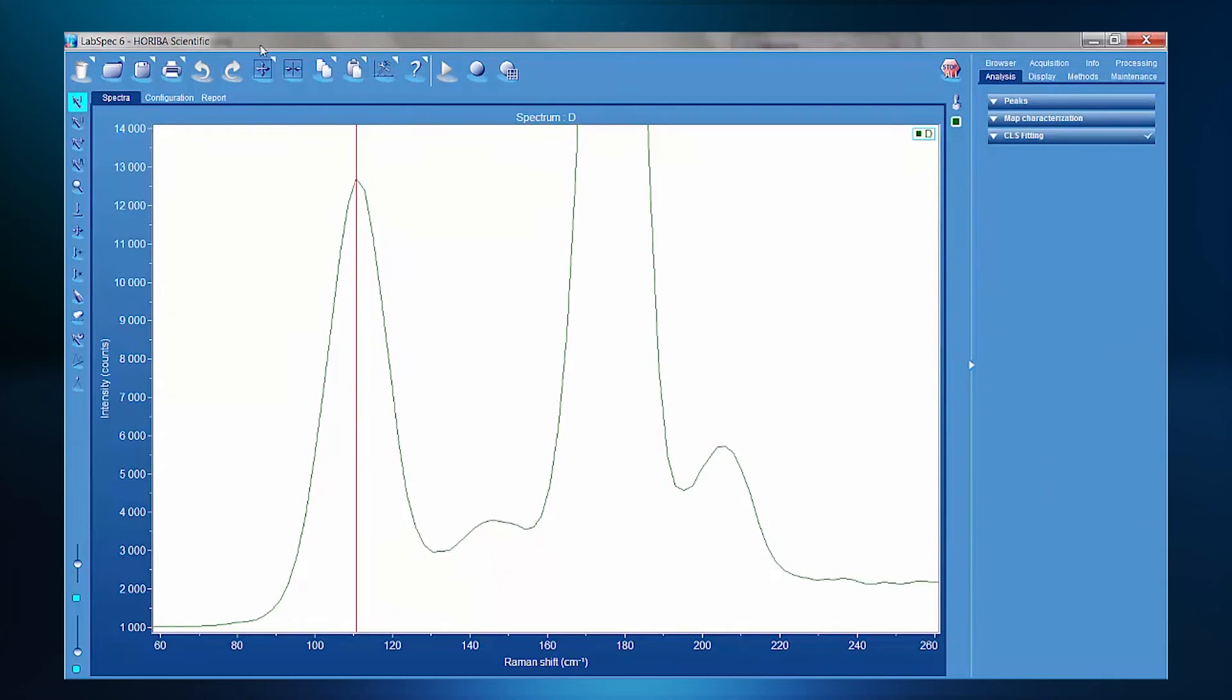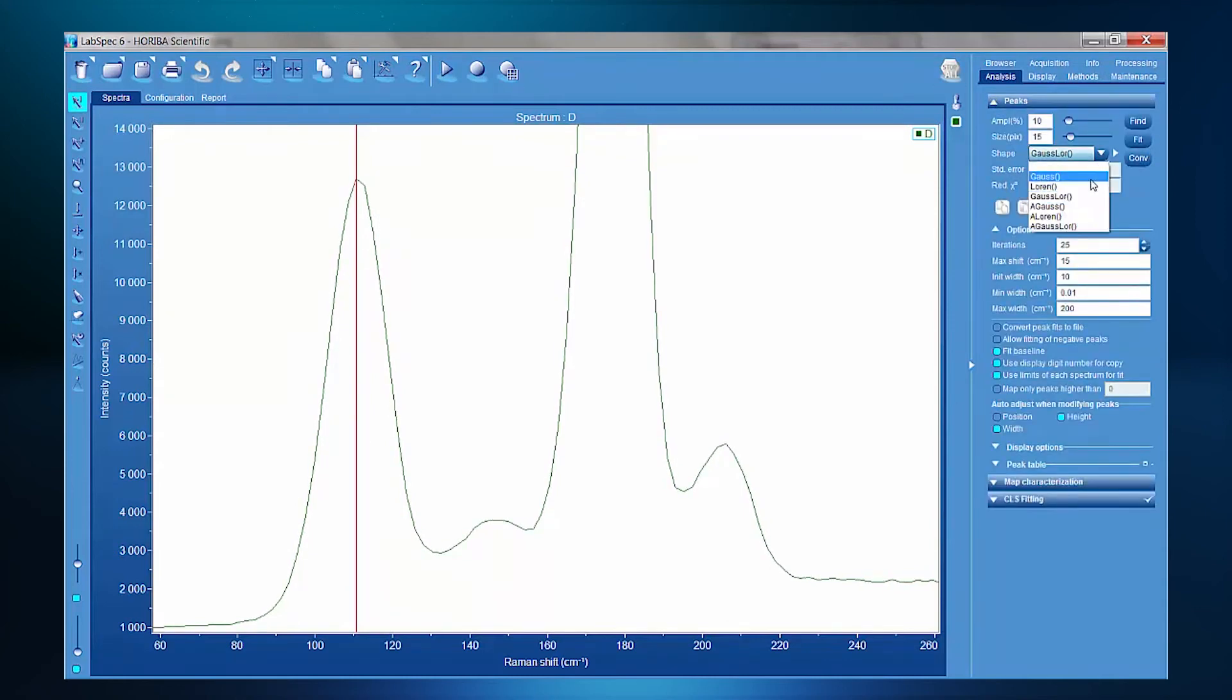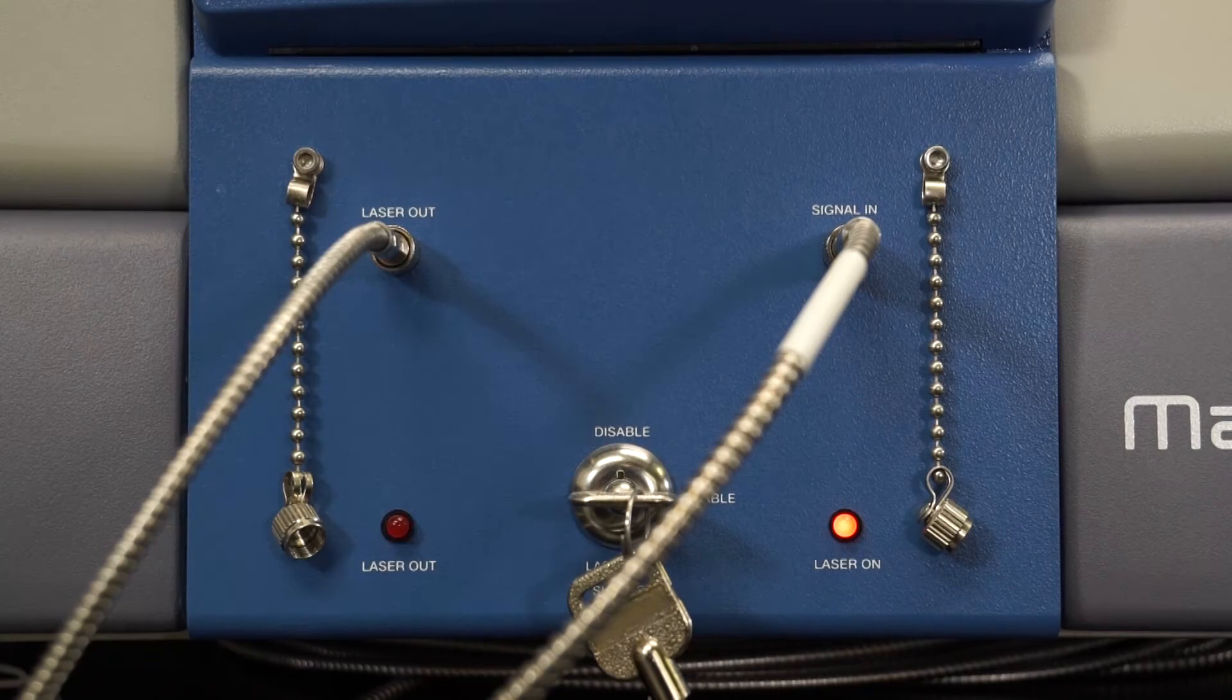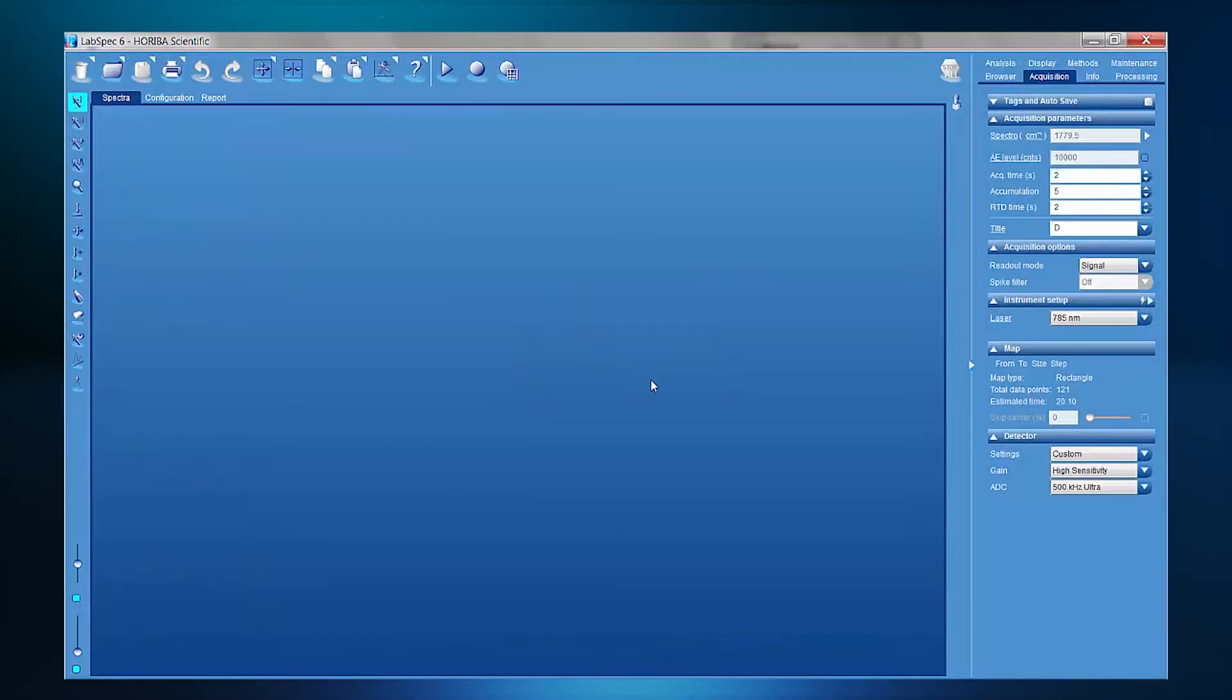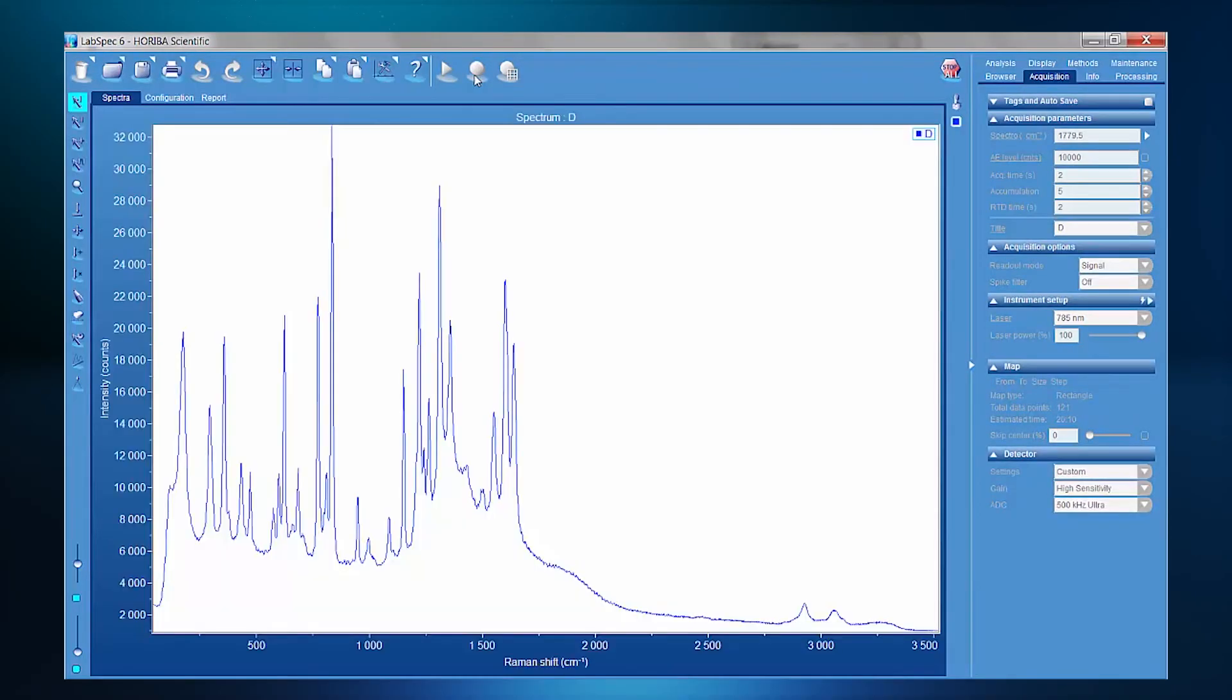LabSpec 6, the industry-leading Raman software, delivers a unique environment for complete device control and data processing, seamlessly combining simplicity with functionality.